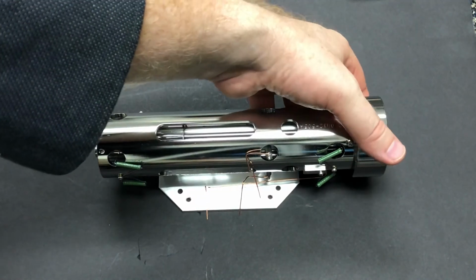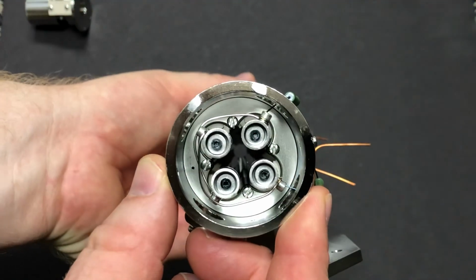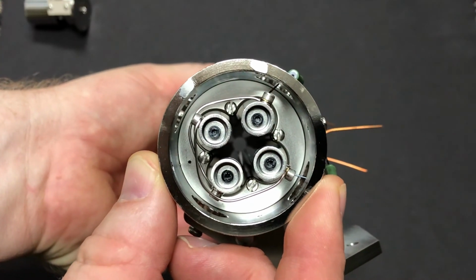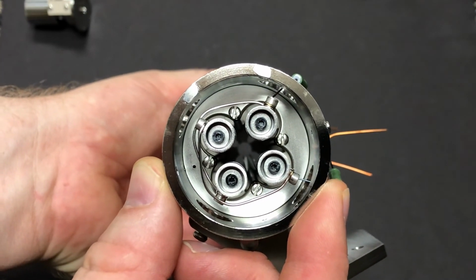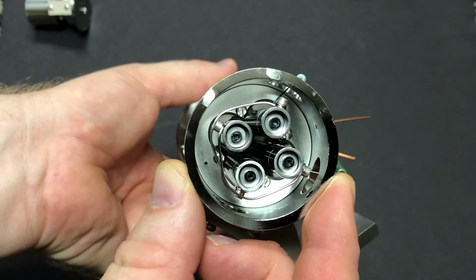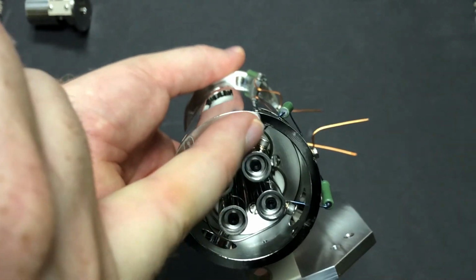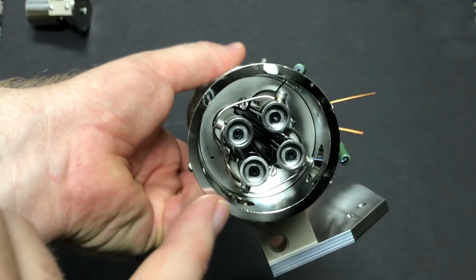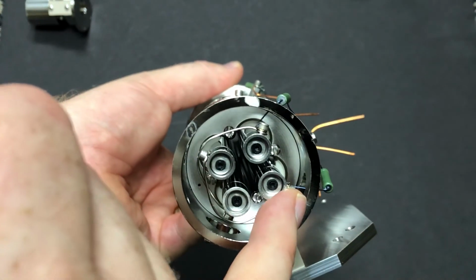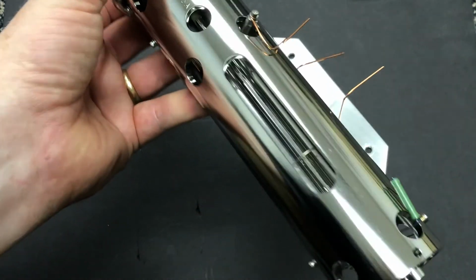All right, if we look at it on the end, we can see the 4 poles again, and that path down the tube. If an ion gets through the tube all the way, then it gets to hit the detector. We can see that we have these poles in pairs. This pole is connected to this pole, and the other pole is connected to the other pole with that wire. That's going to be important later.